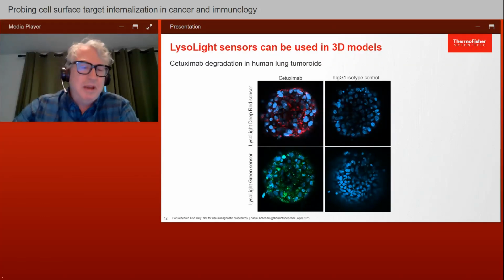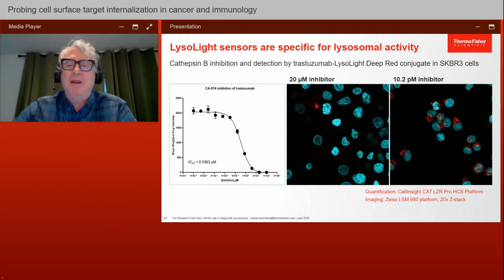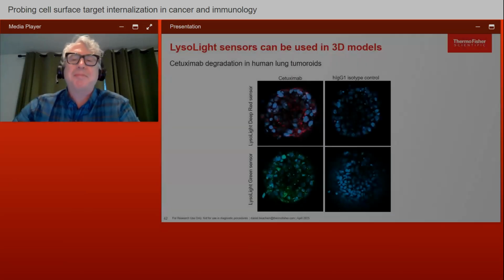And so yeah, it's one of the selectivity criteria we have, and there's actually some more data on our website. Let me back up here. There's also some more data on our website showing these cathepsin inhibitor function in the cuvette, showing that we have good confidence in the inhibitor itself. So this makes another nice control for the activation of the dye by cathepsin.